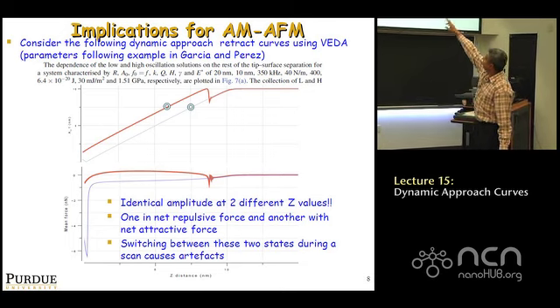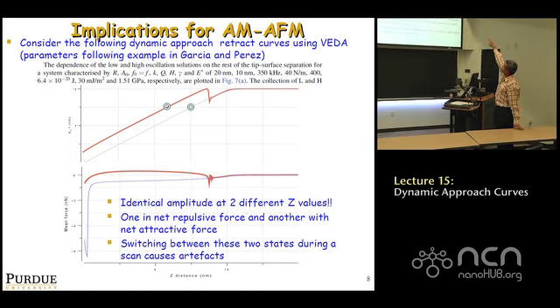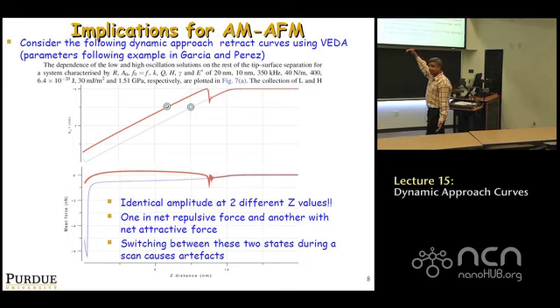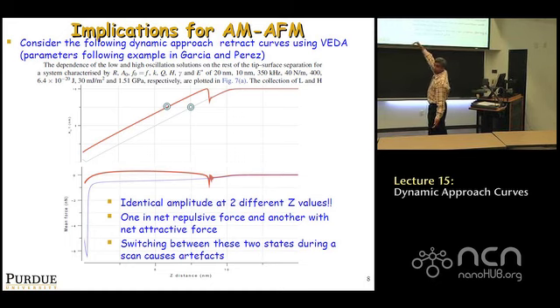Okay? The top curve is the amplitude of oscillation. So you have an initial amplitude of 10 nanometers. And as you approach the sample, you're approaching along the blue line. So at about Z equal to 10, the amplitude starts decreasing along the blue line, right? Keeps decreasing because of the interactions, right? So just as we expect. On the other hand, when you retract, move away from the sample, the amplitude follows the red line up until Z equal to 8 nanometers when it suddenly snaps out and jumps back to the same curve that was traced by the blue.